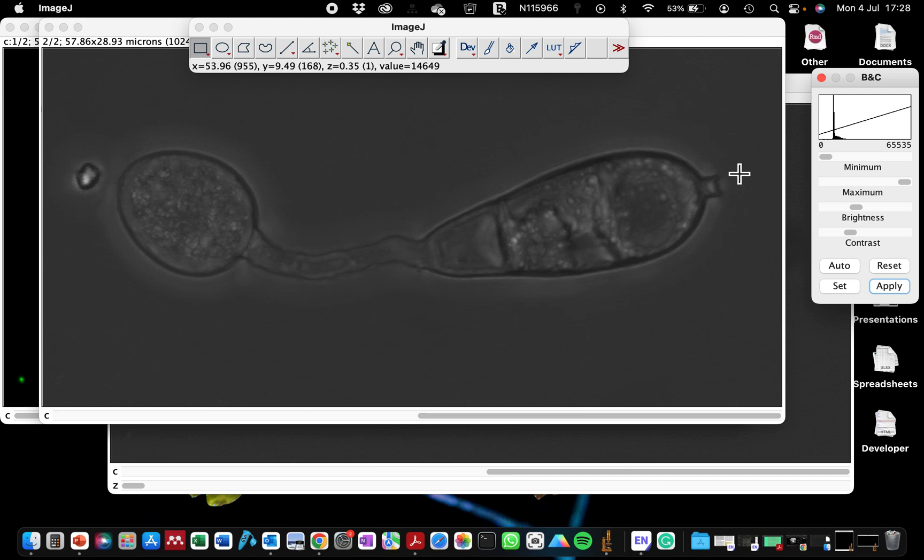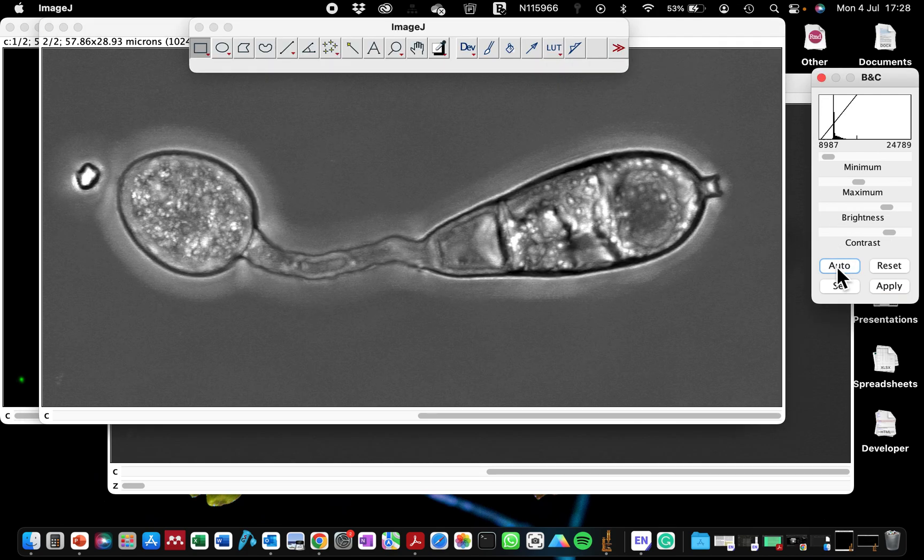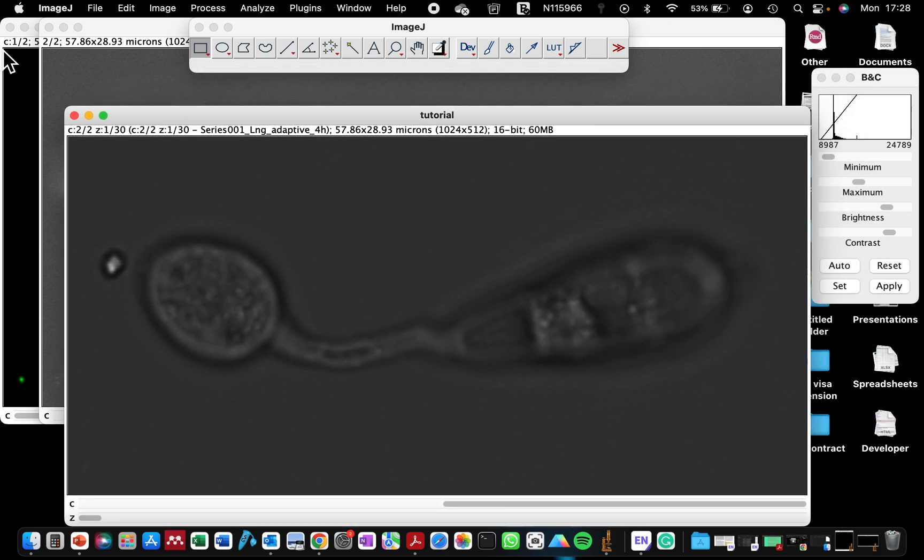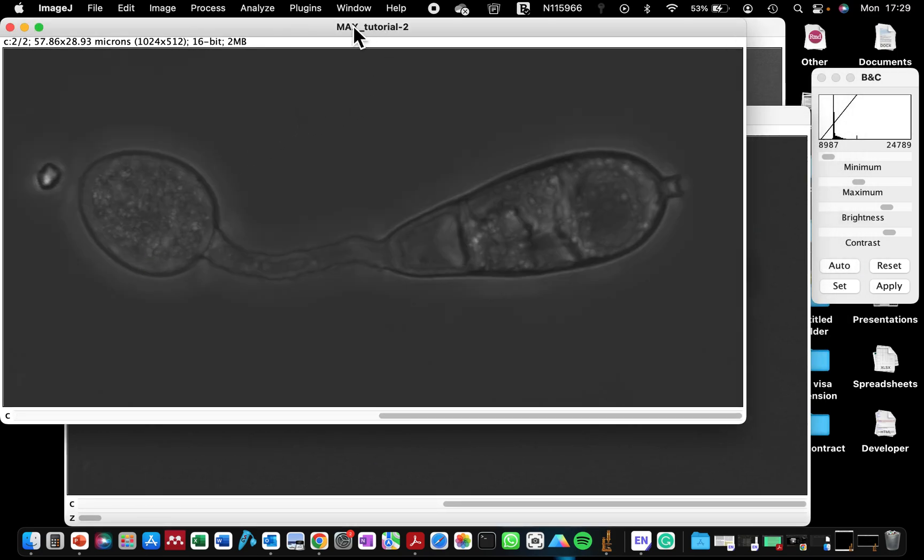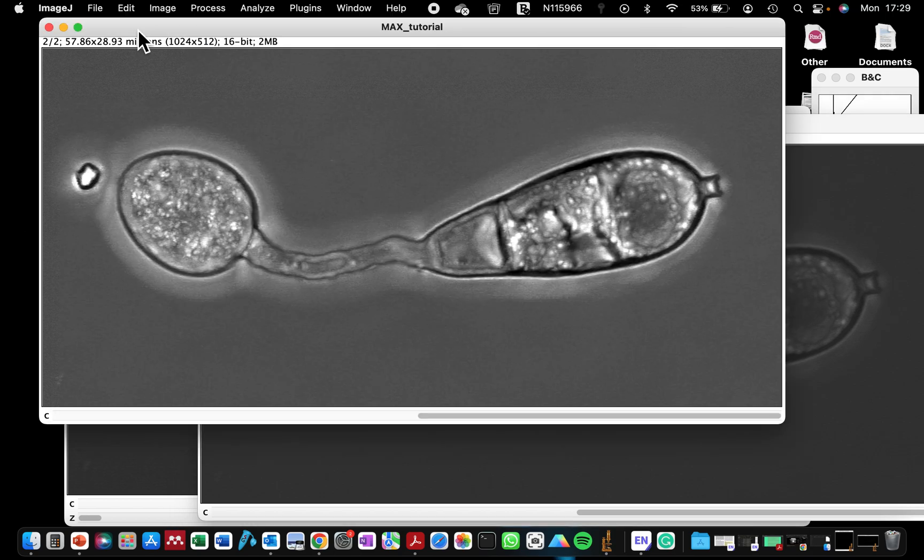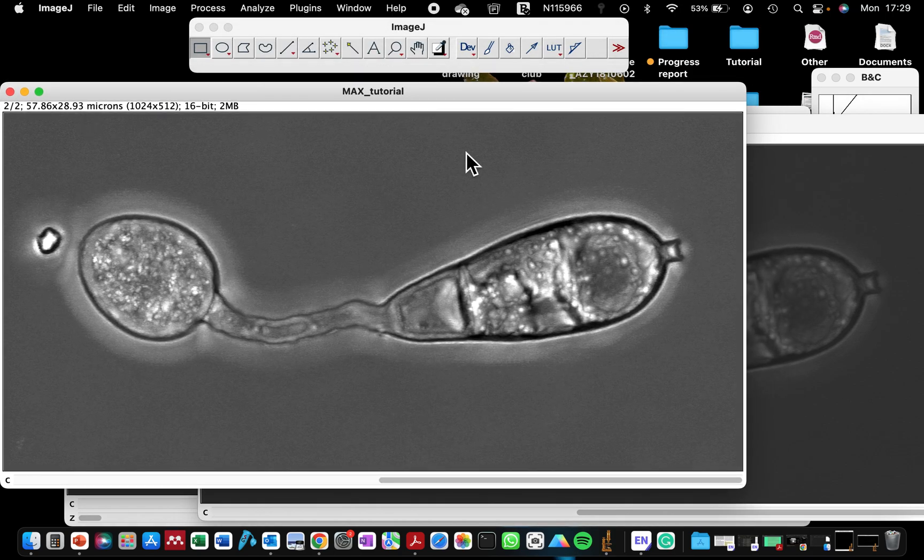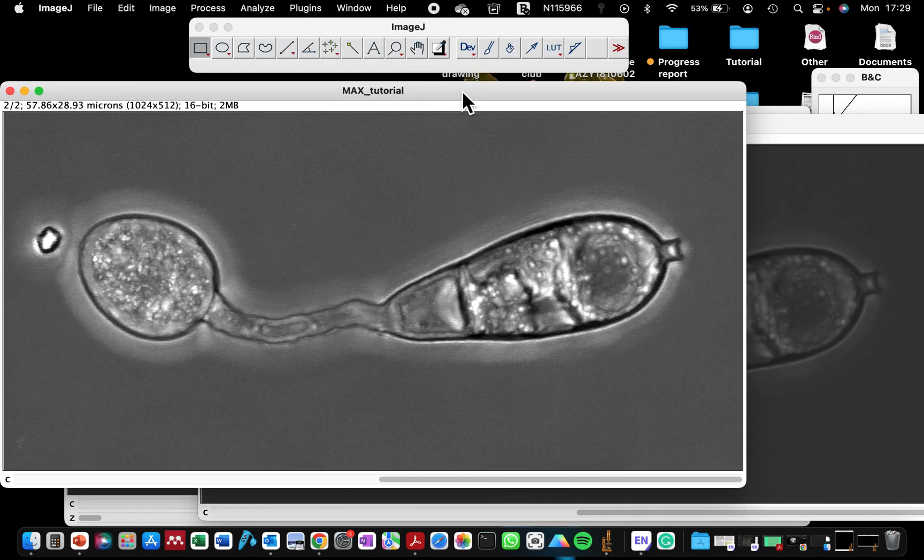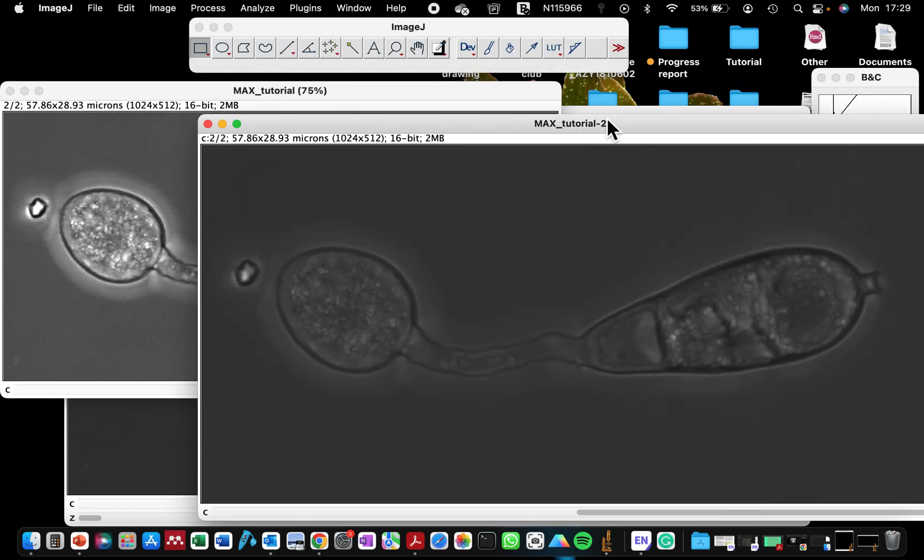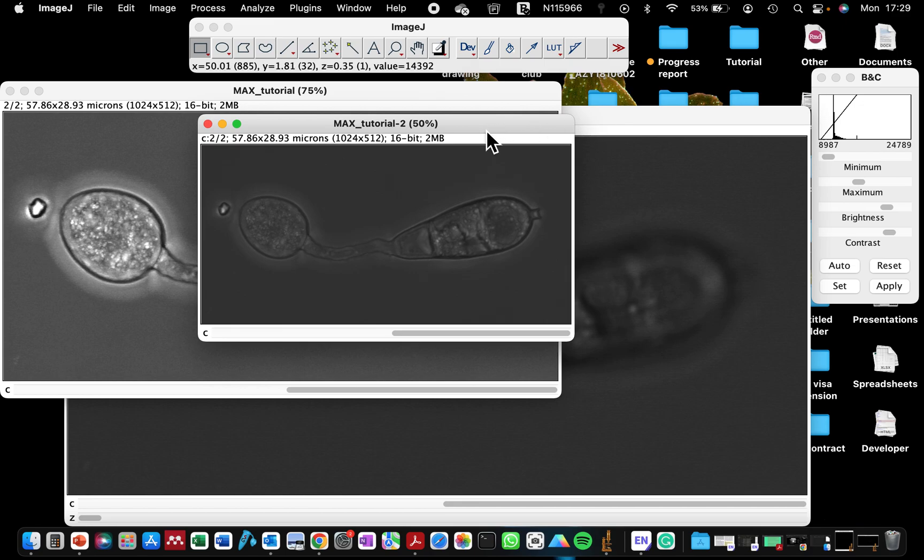And also with the bright field, you can click on the auto function and you can see that automatically also brightens that compared to the original. You can see the original here, and this is the one that we've applied auto control to.